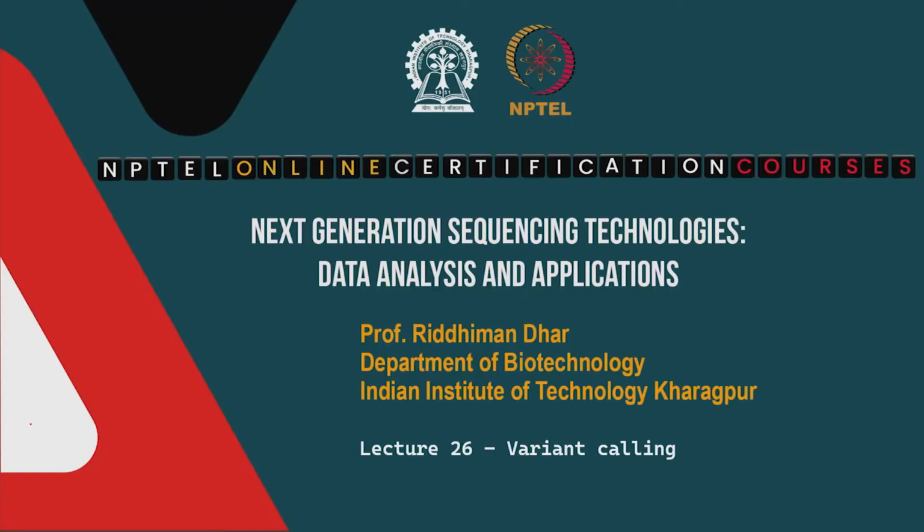Good day everyone, welcome to the course on next generation sequencing technologies, data analysis and applications. In the last few classes we have talked about read mapping, we talked about the algorithms and we have seen how we do the read mapping hands on. So, once we have done the read mapping, the next step is to do variant calling. So, this is what we will be focusing on today.